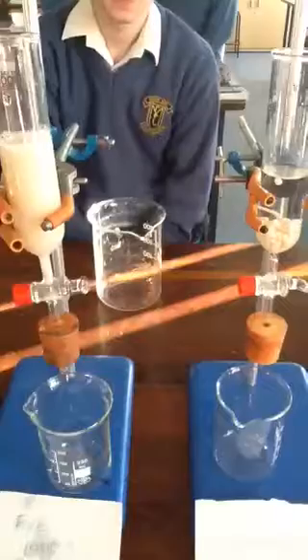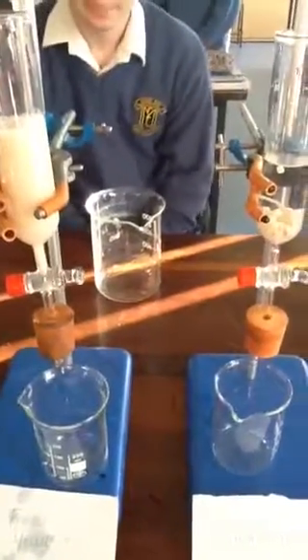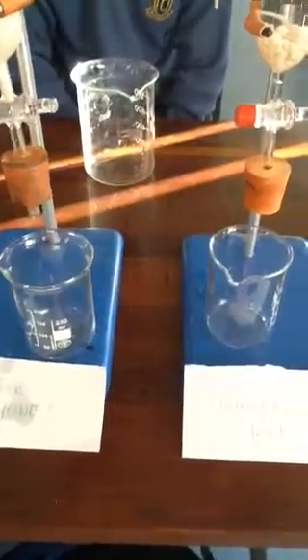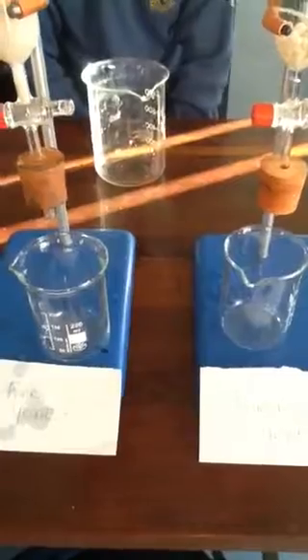Now, which of these two enzyme solutions do we expect will convert the sucrose to glucose more quickly? The free yeast or the immobilized yeast? Isabella, which one will convert it more quickly to glucose?